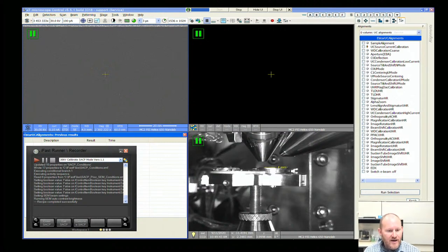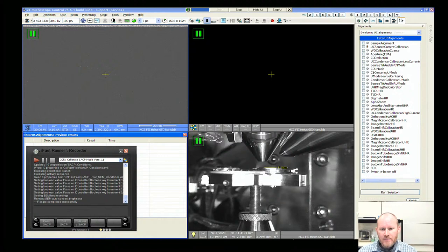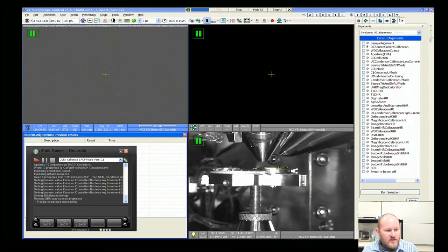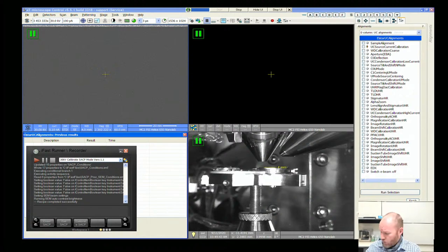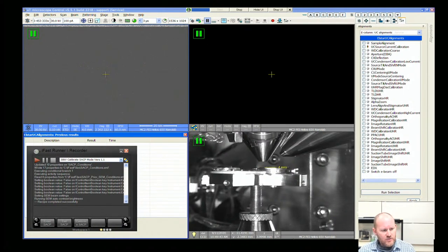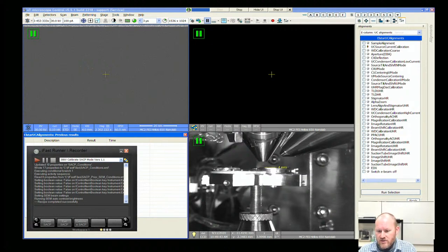Thanks for signing on, looks like we are now streaming live. Today what we'd like to do is demonstrate the selective area channeling pattern collection on the Helios L-Star column. We've been setting it up a little bit before we started but there's still some more work to do. We're going to walk through how we use our iFast script to enter and exit SACP mode, how to calibrate that, and also how we build the dependencies. If you have questions you can utilize the chat feature.